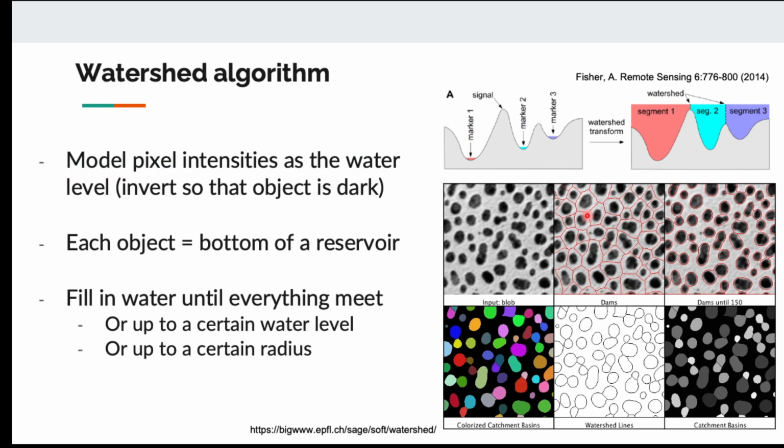Okay. So once you are able to isolate all the individual nuclei, the next step would be how to define the cell. In this case, there is a cool algorithm that I want to introduce. It's called the Watershed algorithm. The idea behind the Watershed algorithm is, let's say you identify the position of the nuclei, you isolate them into individual nuclei.